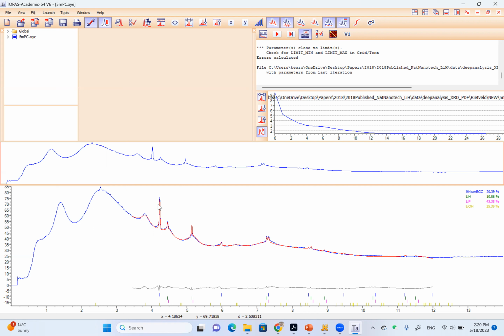You can get high quality data within like 20 seconds, at most 1 minute. And the counts you get for the strongest peak are usually on the order of hundreds or thousands, right? But here we're talking about the strongest peak that only has about 30 counts. So we can have an appreciation. This is indeed a very challenging environment.